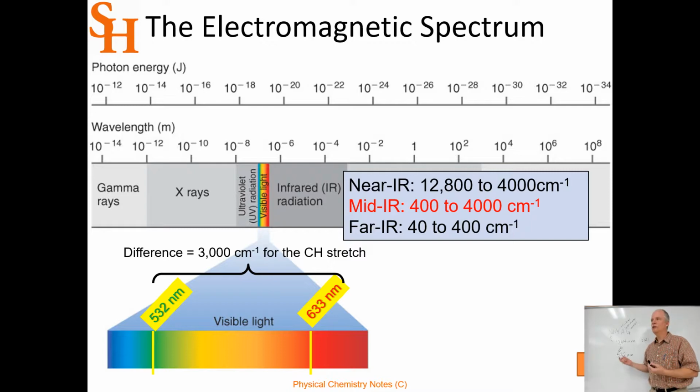And so these spectrometers are really cheap now. The laser is pretty expensive. That's probably still the most costly thing, getting the laser and the nonlinear optics for doubling the frequency. And so this 532 nanometer laser is what we have in our spectrometer.